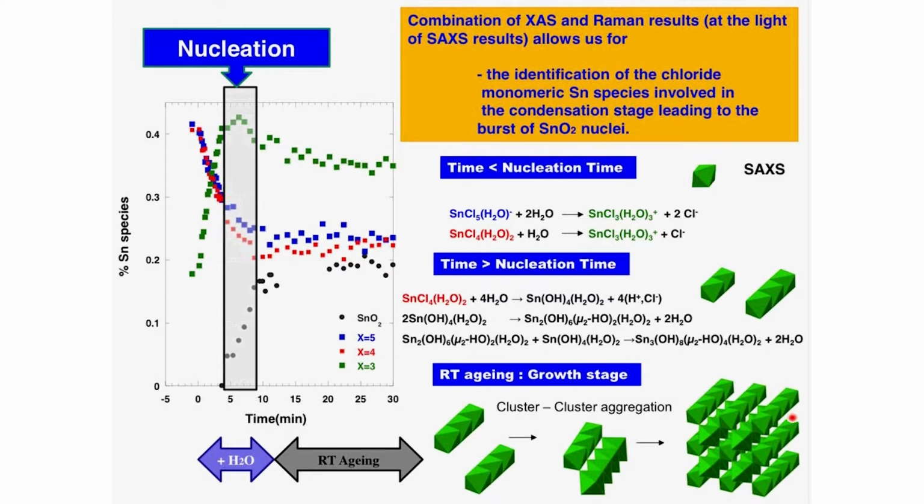So, dealing with this first example, I would just like to mention that without this complementary information gained by EXAFS and Raman spectroscopy about the species in solution, we were not able to describe so completely the mechanism leading to the formation of these tin oxide nanoparticles.